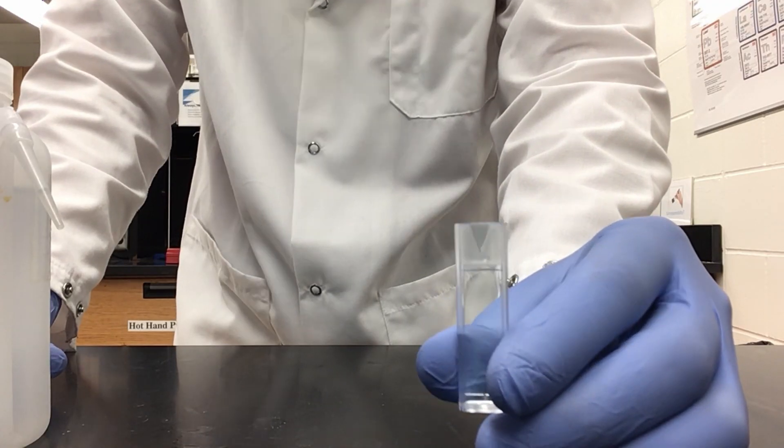Now we have all of the solutions we need to measure our absorbance. Back at our Spectronic 20, we can take our four solutions — our blank of distilled water, dilute tetrachlorocobalt, our hexa-aqua cobalt, and our mixture. As you can see, they are all different colors. We will take and measure the absorbance using our Spectronic 20.